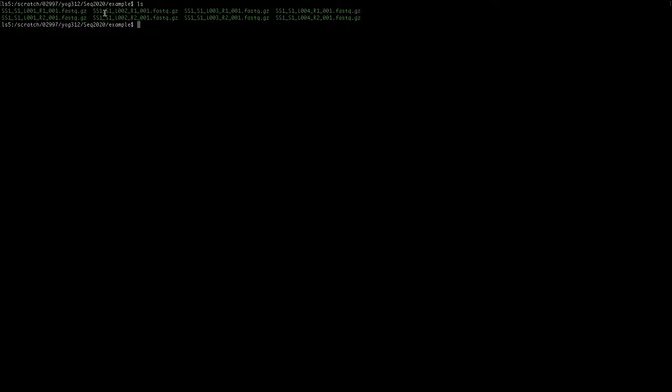R1 and r2 are always generated by paired-end sequencing. The first step is to combine these four r1 files.